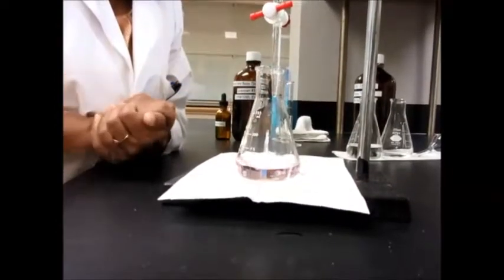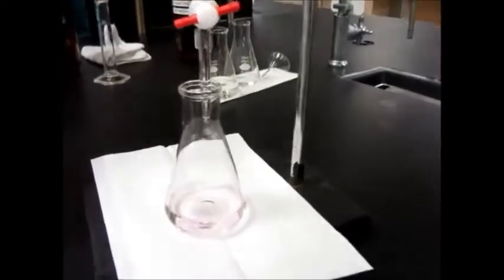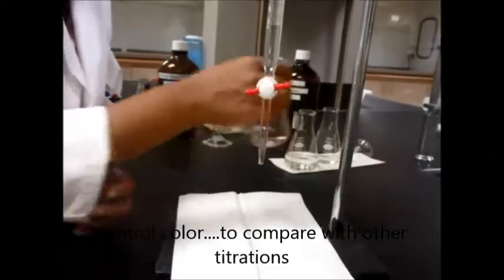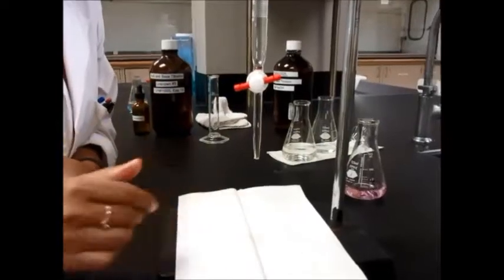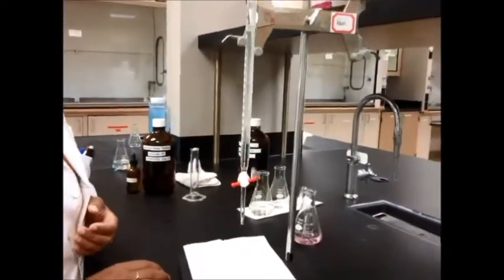This pink color looks like it wants to stay, so I'm going to leave it, read my burette, and use this as my color marker so I know what color I reached the first time. Then do two or three more titrations in order to get precise readings.